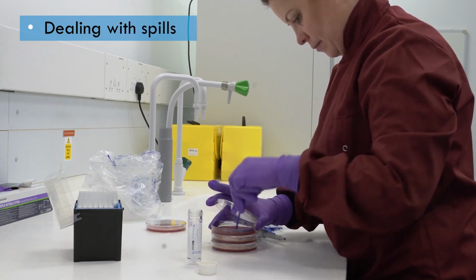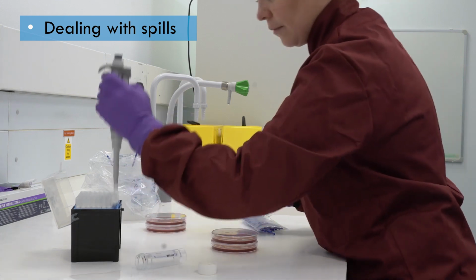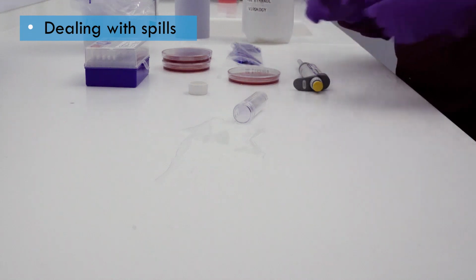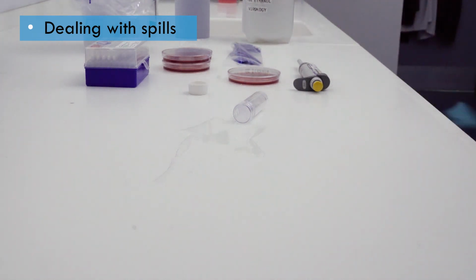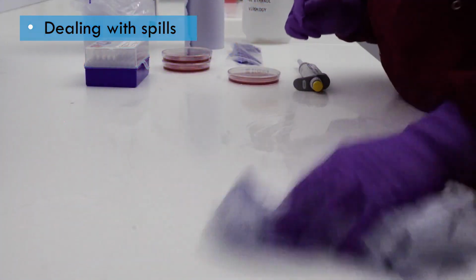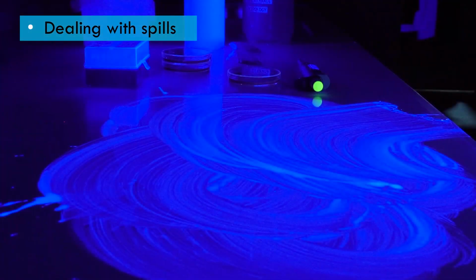Even if good microbiological practices and procedures are in place, spills will occur. A spill may appear to be very limited, especially when it's a transparent liquid. Here, switching to UV light activates a dye in the solution, which shows us that it has splashed out over a much wider area. Cleaning up the spill might seem a quick and easy job, but the UV light shows that a lot of contamination has been left on the bench and the gloves.